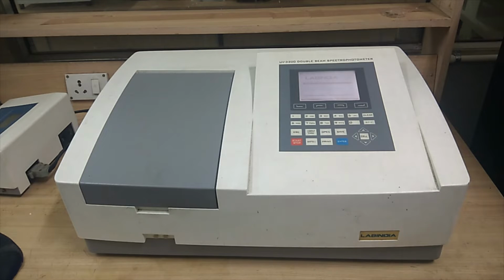We will now look at the protein estimation, and this estimation we will do through the Bradford method. The Bradford method is the most commonly and widely used method for protein estimation.